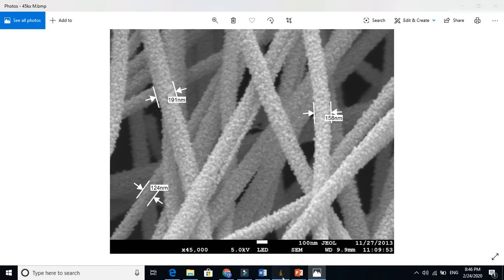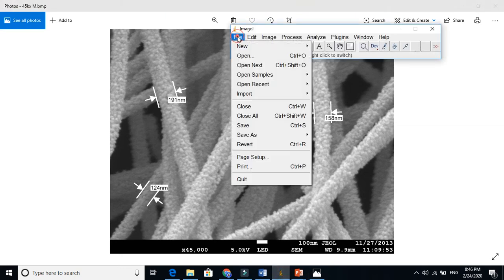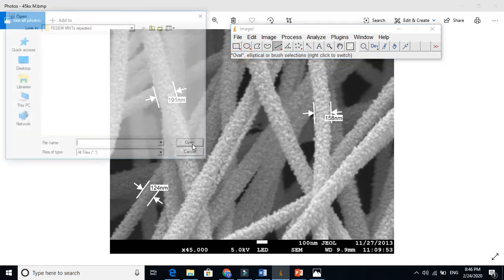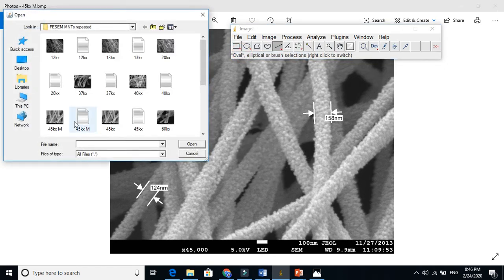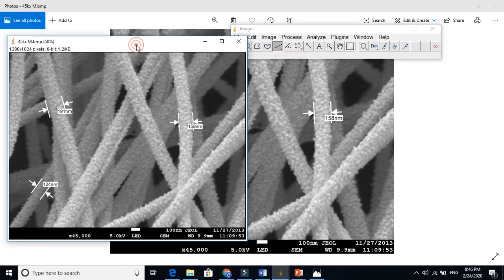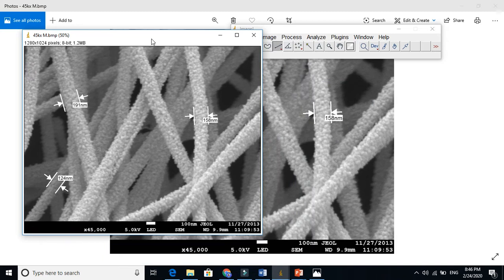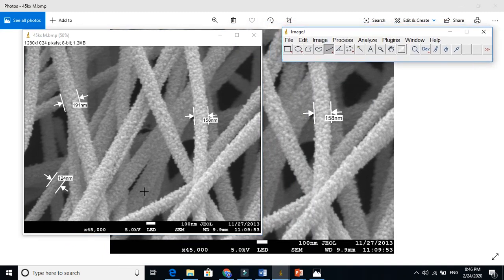Let's go to File — the first thing is to open the image in this software. This is the image which we are talking about. You can see the similar image here. So the first and foremost thing is it is a diameter, so we have to take the line here.